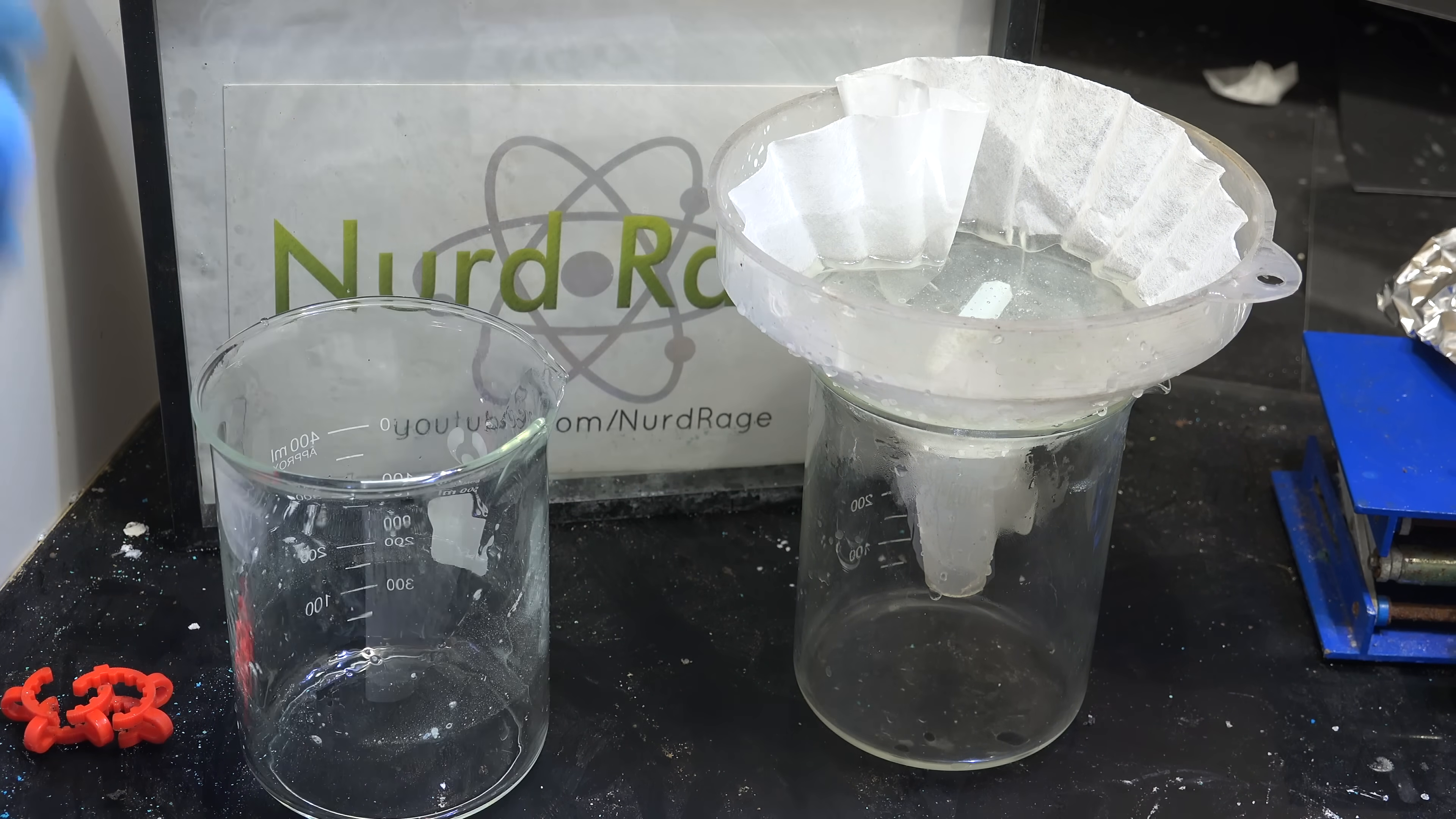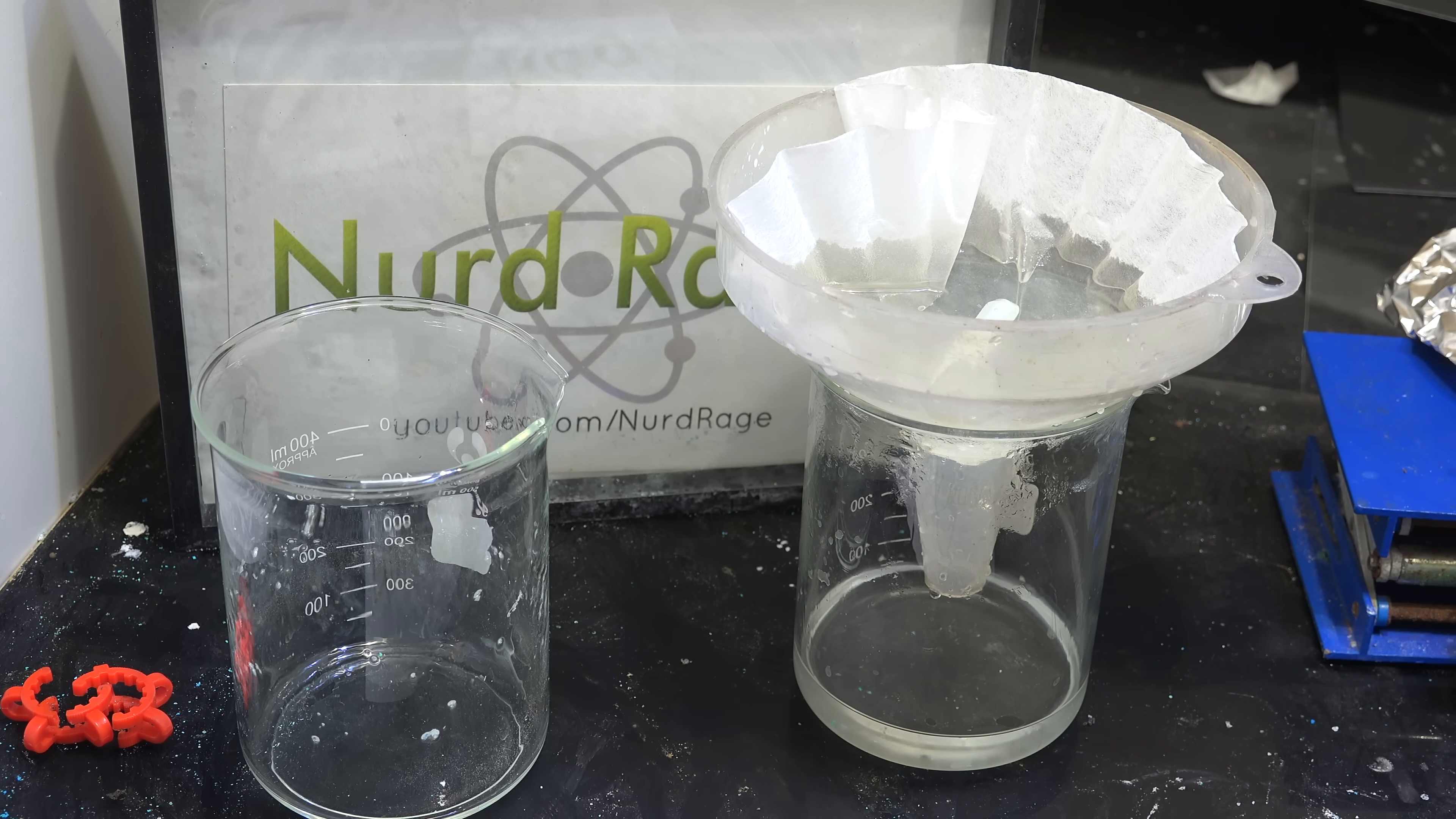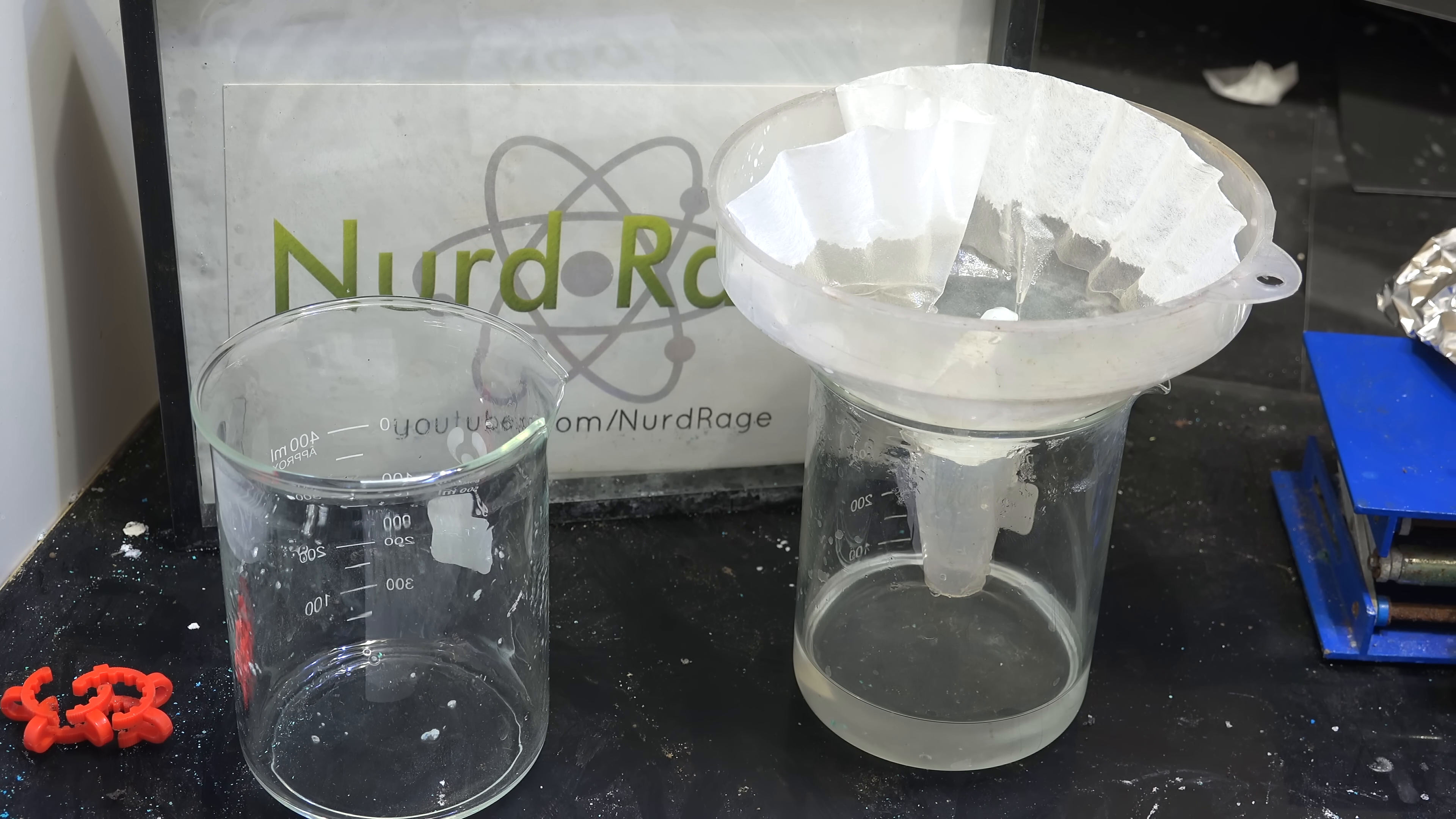If it's cold, it becomes a viscous syrupy mass that's extremely slow to filter. Now whatever you do, do not use fritted glassware to filter the sodium silicate. Sodium silicate is essentially dissolved glass and can clog your frit. Use a disposable paper-based filter.